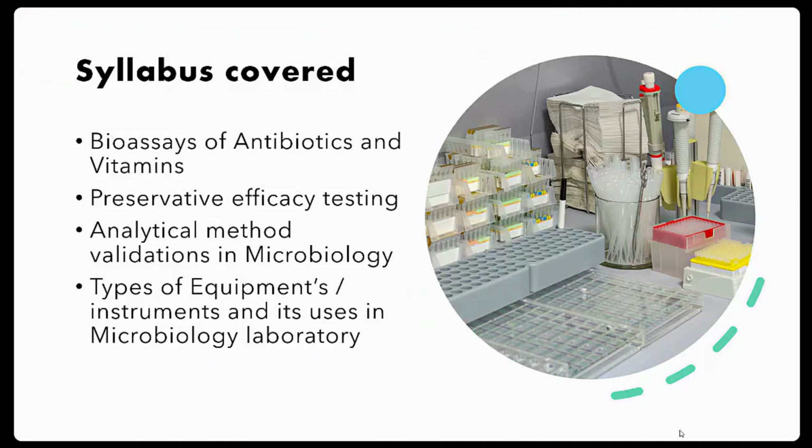We will check by preservative efficacy testing. For stability samples, we will check the preservative efficacy testing. Next, analytical method validation in microbiology. Each and every method which we use in the analysis of microbiology samples should be validated. By the method validation, we can come to know whether the sample testing which we followed is correct or not. In this also, we'll challenge the known number of microorganisms and we'll check the recovery.